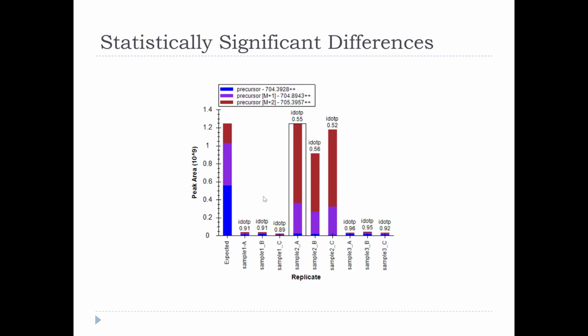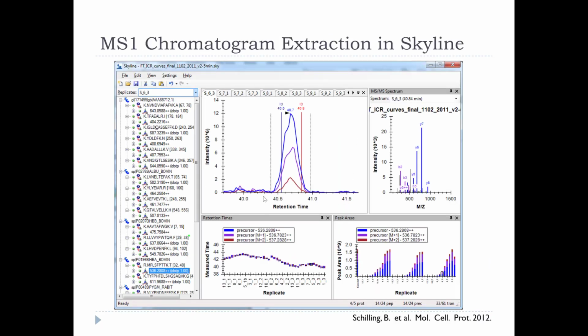When I load into Skyline files that contain MS information, I get all these IDs shown, and also I get the sequence displayed above my spectrum. However, no database search or anything has happened yet. So how does Skyline decide on this amino acid sequence based on that spectral information?